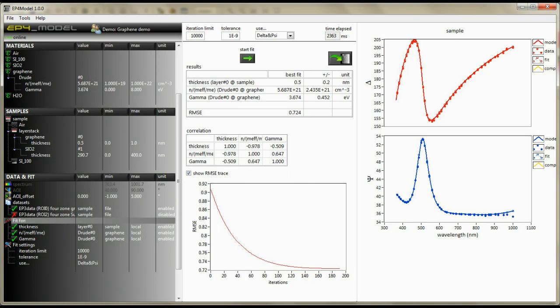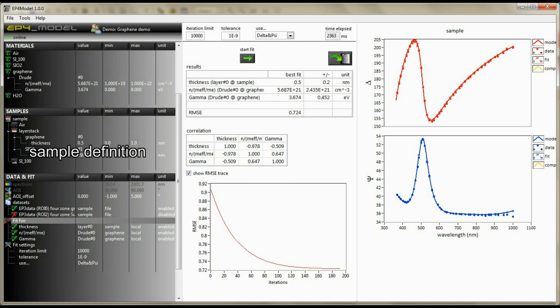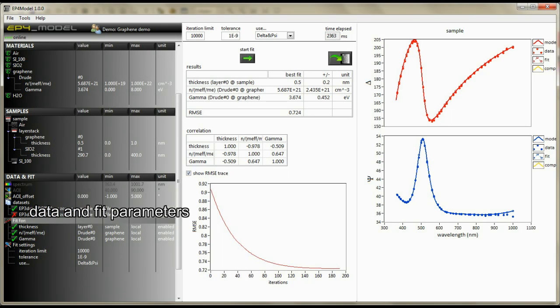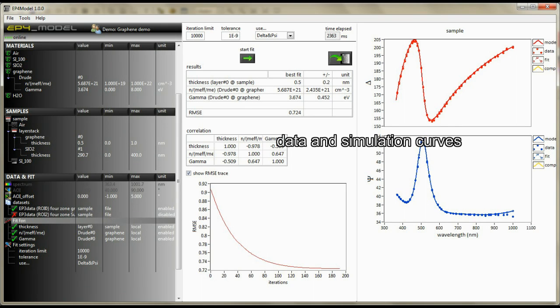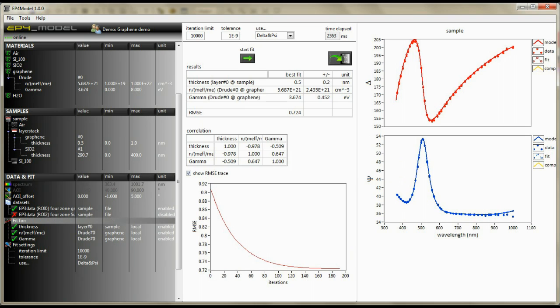The all-in-one window view allows you to have access to all material parameters as well as to the data, fit, and simulation curves. There are three parameter definition sections.